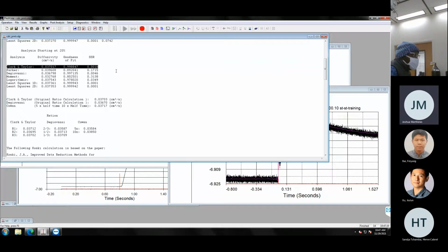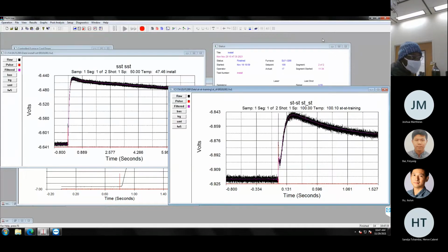Do you have any questions about getting to these files or setting up runs? Yeah, I don't know how to set up a run. Can we go over that, please? Sure. So one thing to remember about this software is after every test, you need to restart the software before you start a new one.